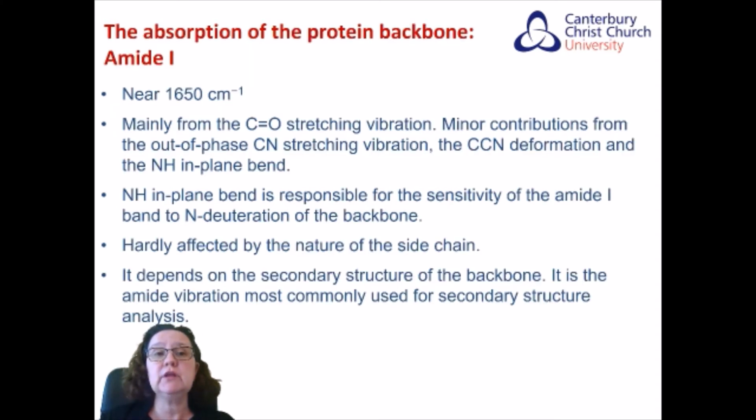Another absorption important in proteins is the amide 1 mode, and this is by far, with amide 2 that I will discuss later, the most useful of all the amide bands, of everything you can observe in an infrared spectrum of a protein. It is mainly due to the carbonyl stretching vibrations, with some minor contributions from other groups, and it can be really useful to determine the structure of the protein, and especially the secondary structure of the protein, and it's widely used in secondary structure analysis.